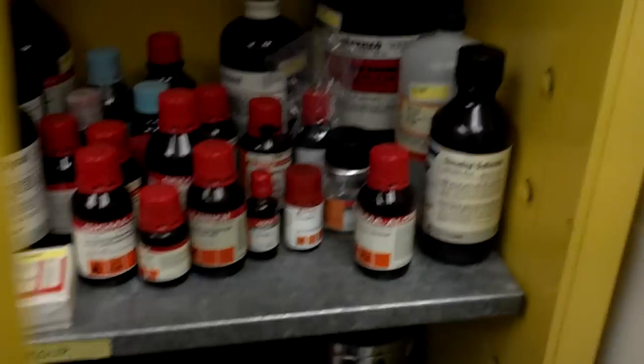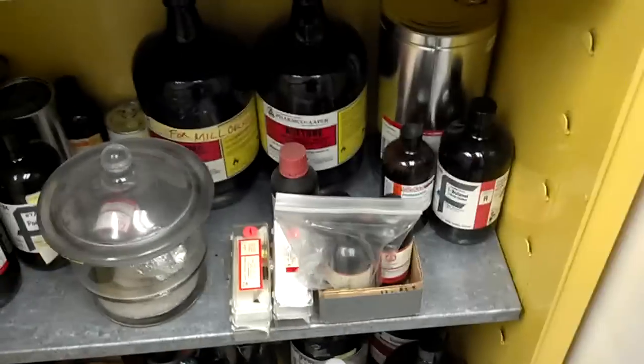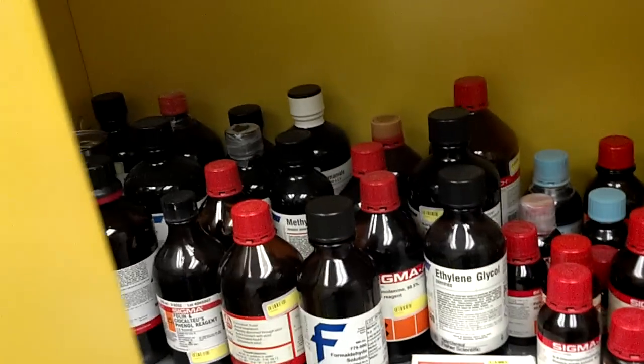This is our reagent room. Flammable. So we have all kinds of interesting reagents in here used for all sorts of nefarious purposes.